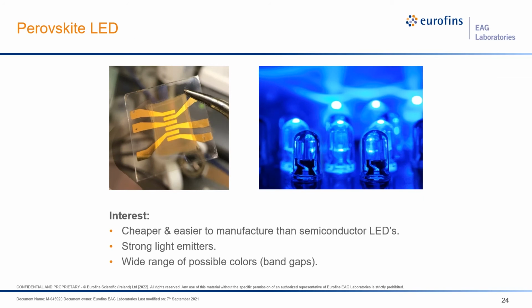The conductive AFM example I have to share with you involves perovskite, which is an organometallic halide material used in solar cells and light-emitting diodes, or LEDs. Perovskites have great promise as a new lighting technology because of their low cost, strong light emission, and tunability. Also, since they don't require high temperatures for processing, they can be used on a great variety of flexible or rigid substrates. And I get real excited thinking about cool light up clothes that we might have in the future.